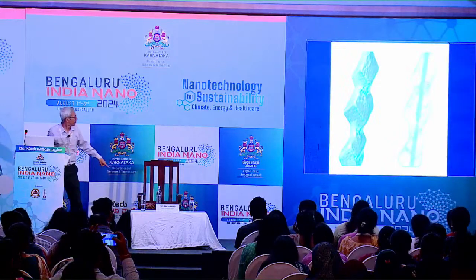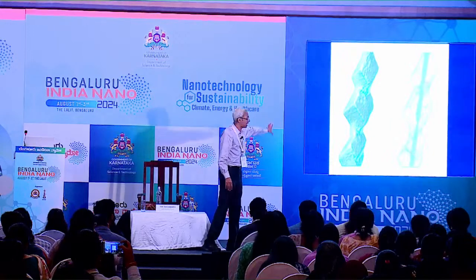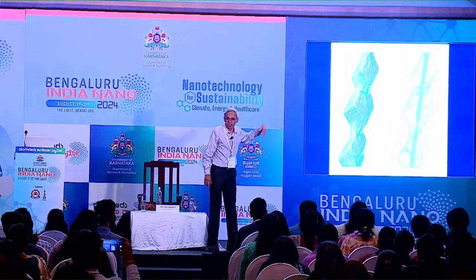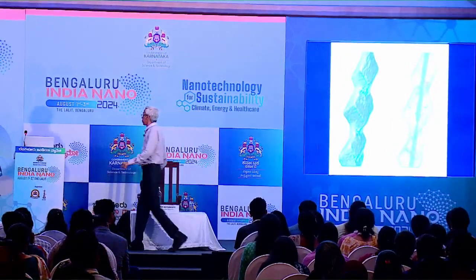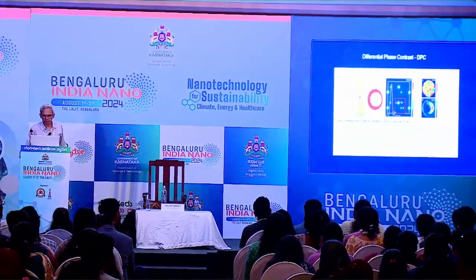nanowires and so on. Unfortunately, this movie is not playing as it was when I saw it earlier, but I'm showing you a three-dimensional reconstruction of such a heterostructure in this particular case, showing you where the individual components are present. Okay.